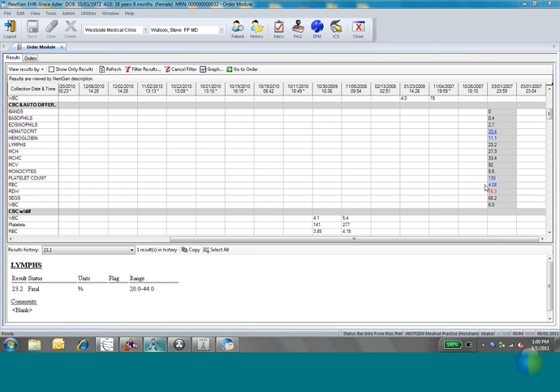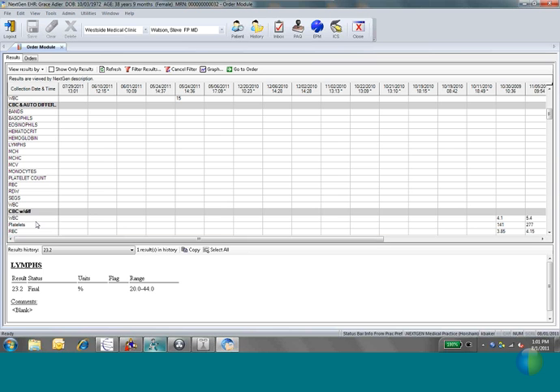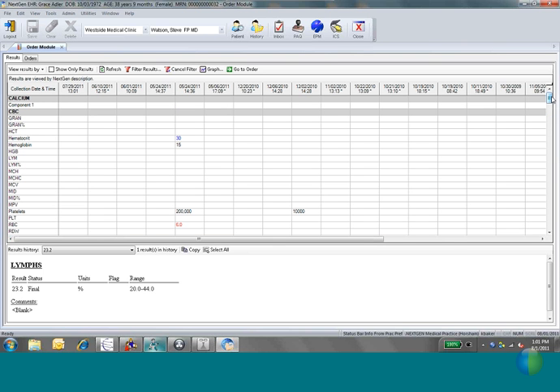All right, question on the board. Our providers are asking if we can set the abnormal results at the top of the list. Is that possible? No, it's not here. You cannot filter anything in this list technically, or you can filter it, but you cannot default it. It's technically going to be listed by the name of the test first, and then the date, and it's always going to be alphabetical by test.